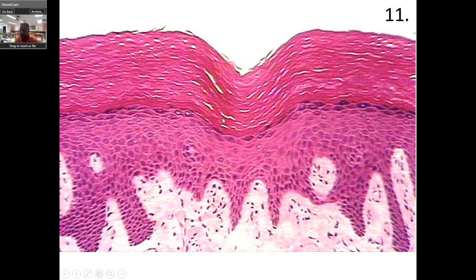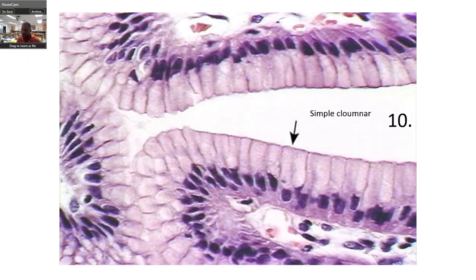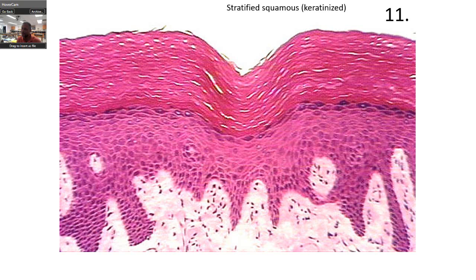This is a cross-section of your skin. You ought to be able to know the tissue by its location, function, and the basic description of the cells. That makes this squamous, but it's stratified — several layers.